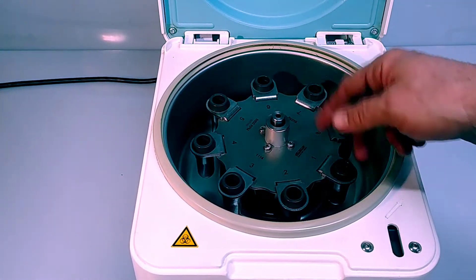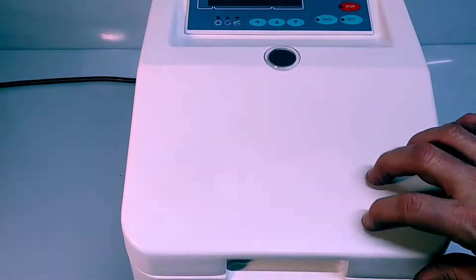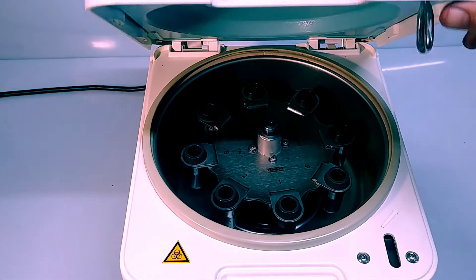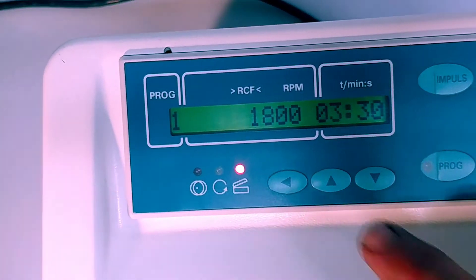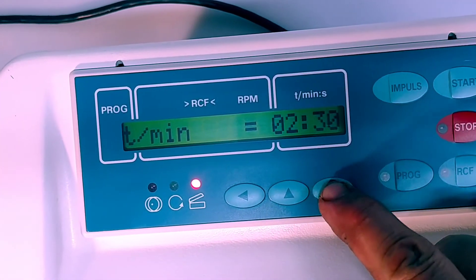Like blood collection tubes and other standard tubes. It's a great little centrifuge — all-metal construction. It's got a positively engaging lock setup right here; simply close it up and that locks it. We'll go through a little bit of the programming now.